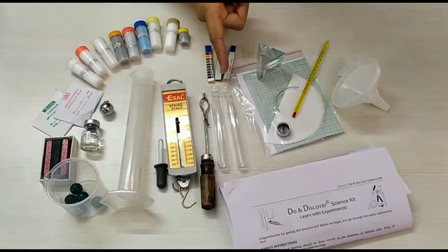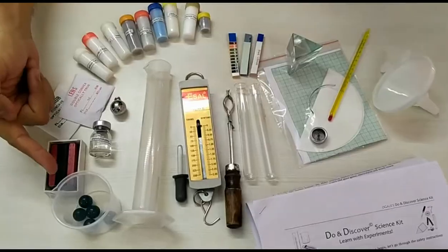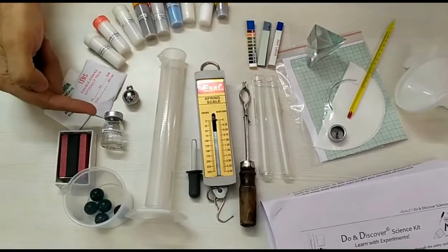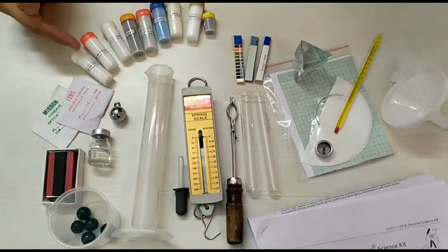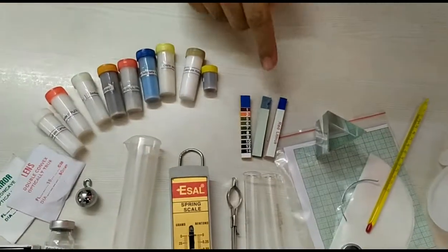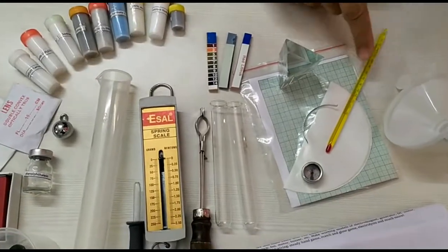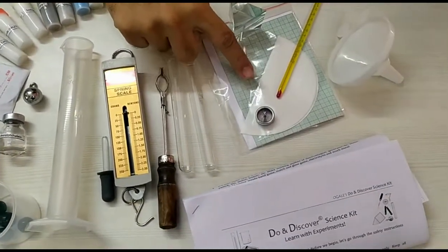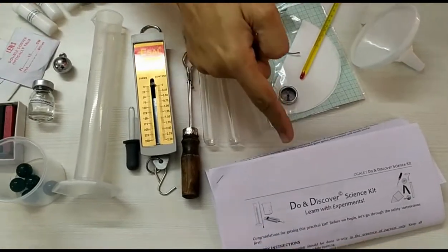This kit contains test tube, test tube holder, spring balance, dropper, measuring cylinder, beaker, bar magnets, phenolphthalein, lens, mirror, pendulum, different types of chemicals, litmus paper, pH paper, a prism, thermometer, funnel, piece of magnesium wire, magnetic compass, filter paper, and a booklet.